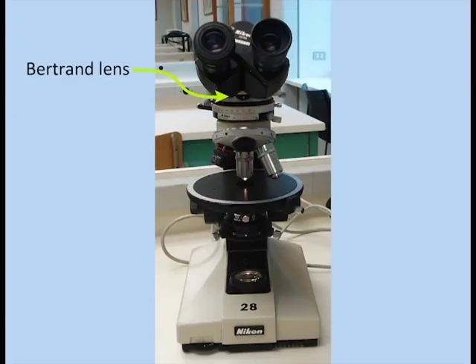First, we will briefly go over the necessary parts of the microscope. The Bertrand lens is used to make the conoscopic figure focused at the eyepiece. Without it, the focused image would be at the rear of the objective lens, making it difficult for the viewer to examine.